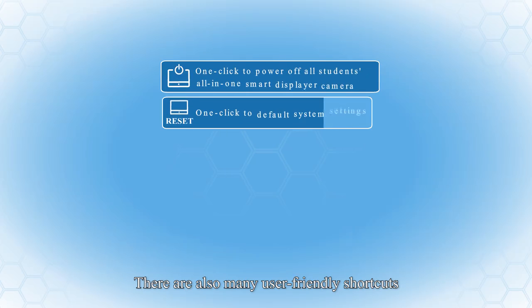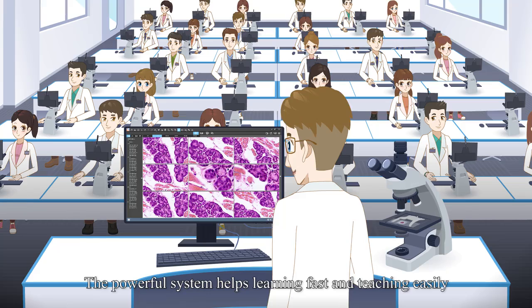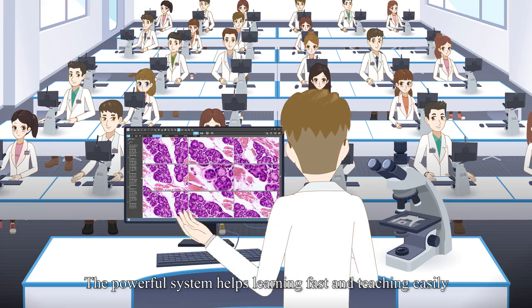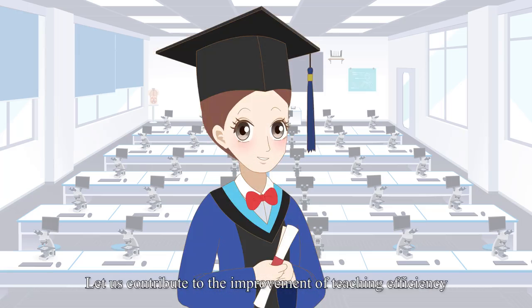There are also many user-friendly shortcuts to help tutors manage the system. The powerful system helps learning fast and teaching easily. Let us contribute to the improvement of teaching efficiency.